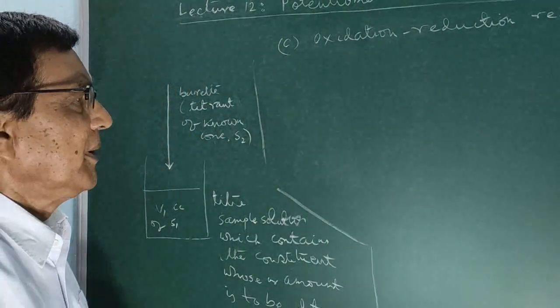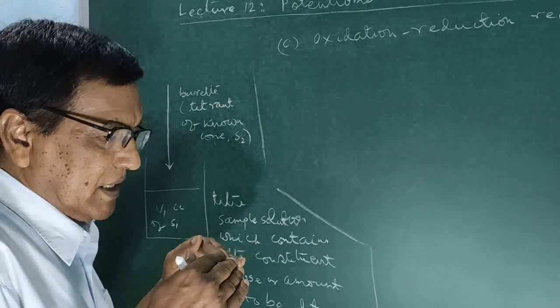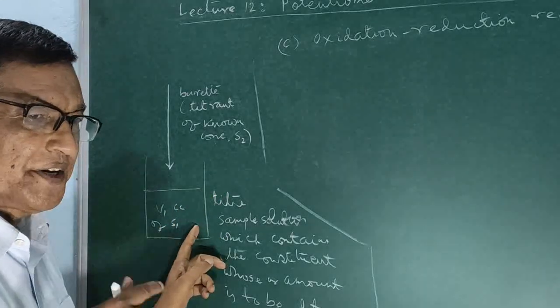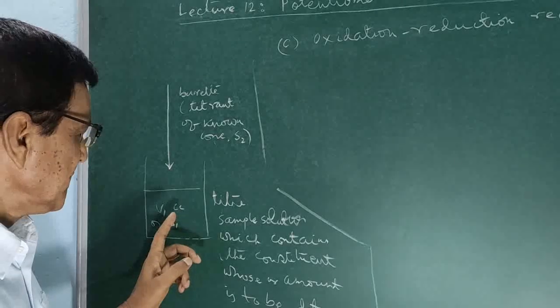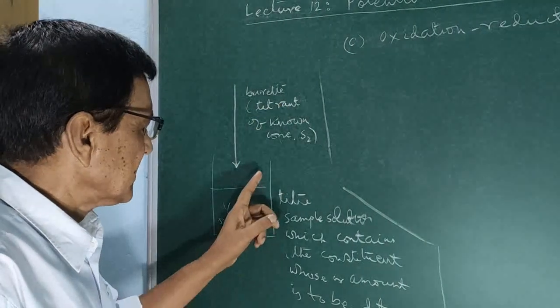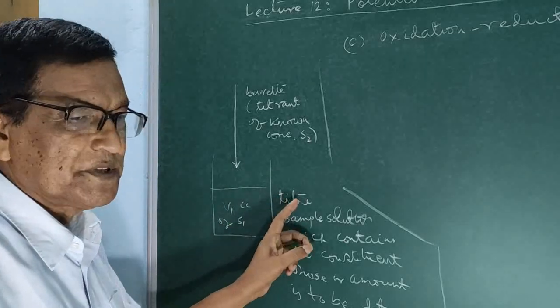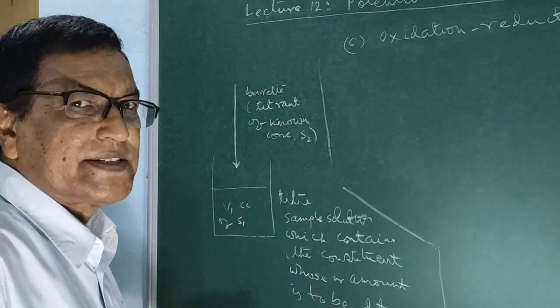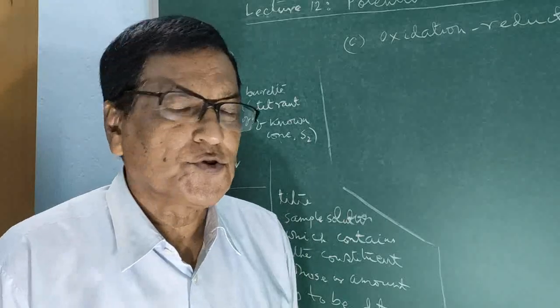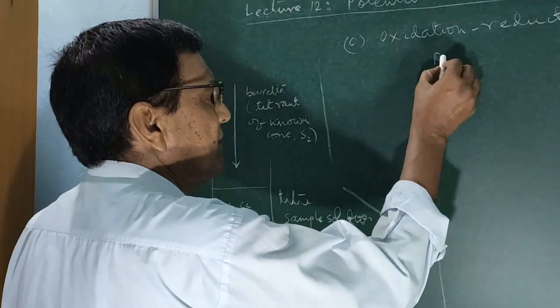As for example, in the case of a titer which contains some reducing agent and the titrant an oxidizing agent, simply a platinum wire is dipped into the solution of this titer, which acts as the indicator electrode.